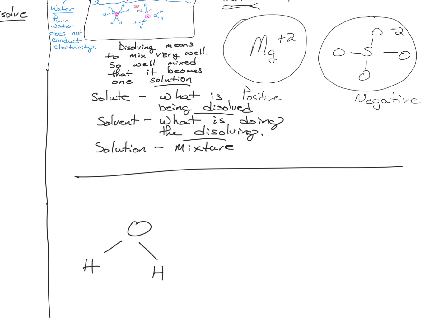So you have water, which is H2O, 2 hydrogens and an oxygen, and you're going to break it apart. And this is what Adam was asking earlier, which is the whole purpose of this lab. Can you break up a covalent bond? The answer is yes. There's many ways to do it. We're going to use something called electricity, and we're going to break it up into hydrogen gas and oxygen gas.